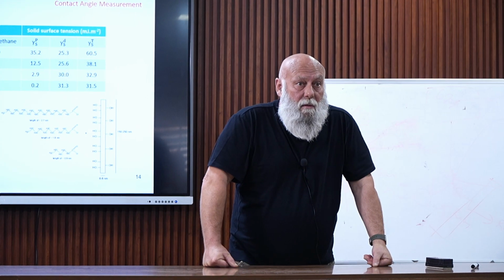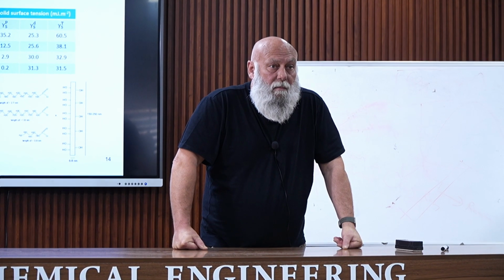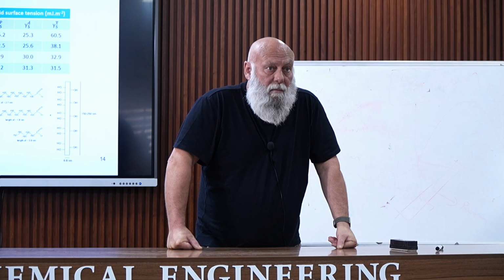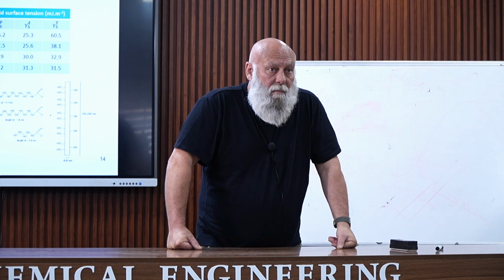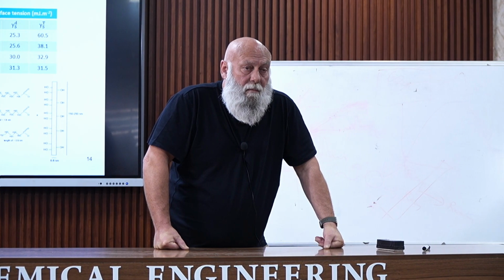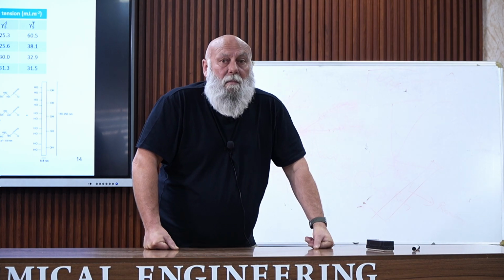My question is, after incorporating filler into the matrix, we don't know whether the ignition temperature of the composite is within the temperature range which we are going to apply or not. So once we perform the TGA analysis, if the ignition temperature of the composite is within the temperature range, it will burn out. So do we need to go through certain characterization techniques, like first performing a DSC, then TGA, or such kind of things?